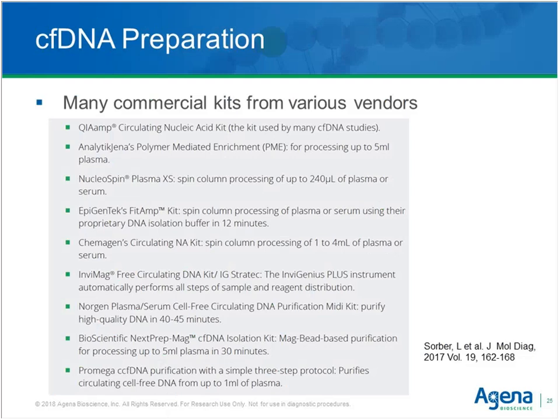So going to the third step, the cfDNA preparation, so the isolation of cfDNA from the plasma. Well, that is something I just want to bring to your attention, that there is a number of providers and kits available, and I don't want to recommend any over the other. So that's a long list. It's probably not even a complete list.